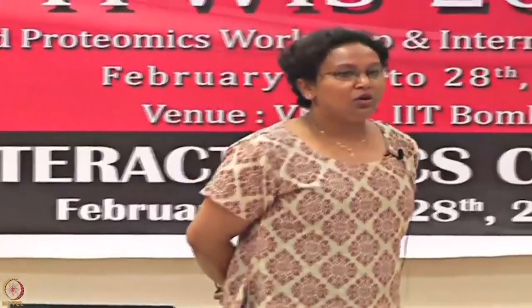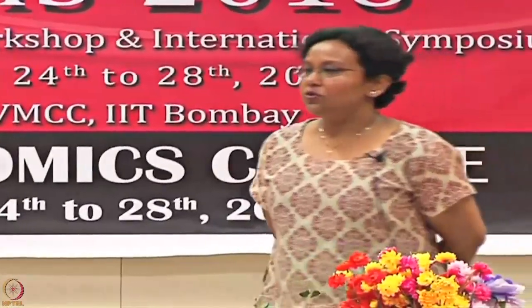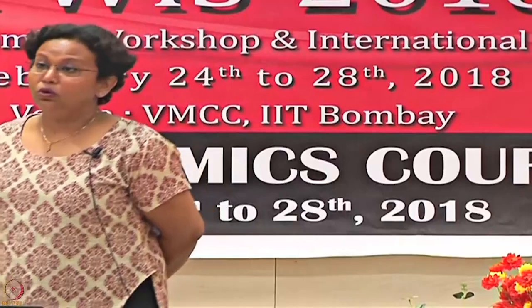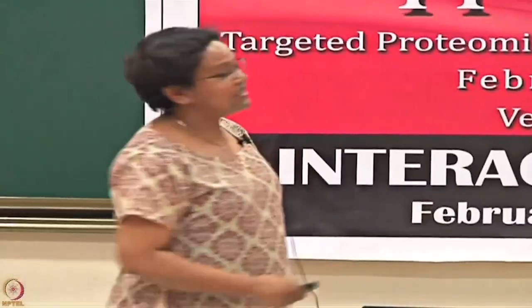Post that, I would like to talk a little bit about the assay development part. When you are ready to start up with your Biacore experiments, what are the things you would like to take care of when you have two interactants and you would like to see the interactions? What are the things you would like to optimize, which one should go as a ligand, which one should go as an analyte, and what would be the reference surface like? So, let's start. This is the basic assay development.